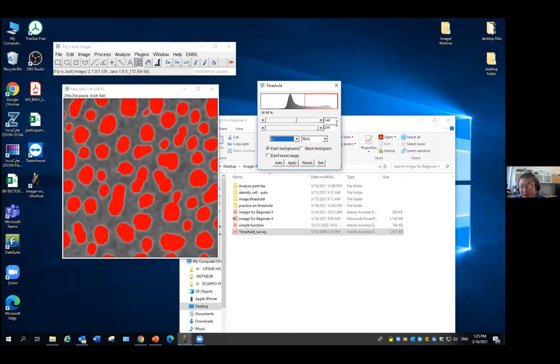So it can compensate for the background change. Even if you have images taken on a different day, because the background is high, it can still compensate and give you a reasonably good outline for the cells. You can still identify the cells better, even with this change. Because you use the same algorithm for two images, even if it gives you different thresholding values, you can still say that I treat them the same. I let them go through the same algorithm, the protocol to calculate this threshold.